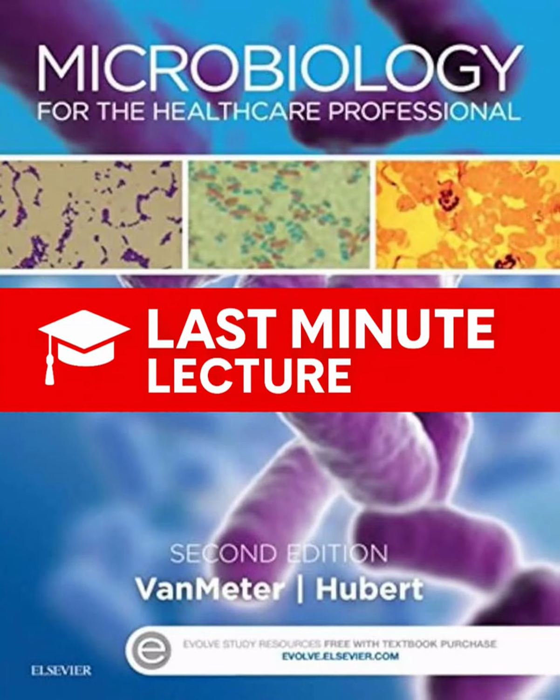Then incubation is putting that inoculated container somewhere with controlled temperature, usually somewhere between 20 and 40 degrees C, to let the microbes grow and multiply. And that culture media, the food, it's not just one thing, is it? Yeah. It can be defined chemically. Right. You've got chemically defined media where you know the exact formula, every single ingredient, down to the microgram.